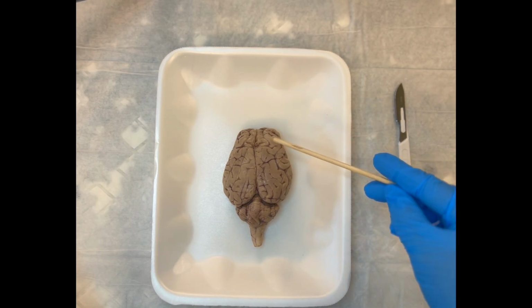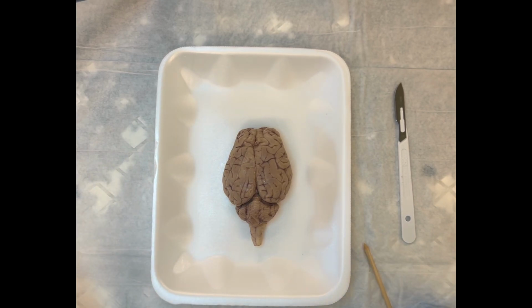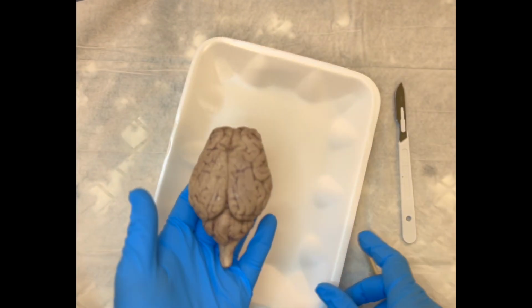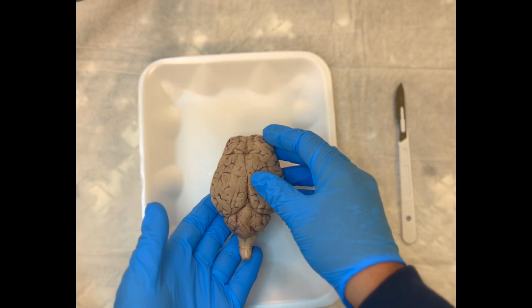With a sheep brain, you're going to notice that it's kind of flattened and compressed. It's more elongated and therefore like an animal. So the brain and the spinal cord, the brainstem, it is positioned a little bit differently than ours. We are bipedal, we stand upright. So we have more of a spherical brain, and the spinal cord is angular downward.